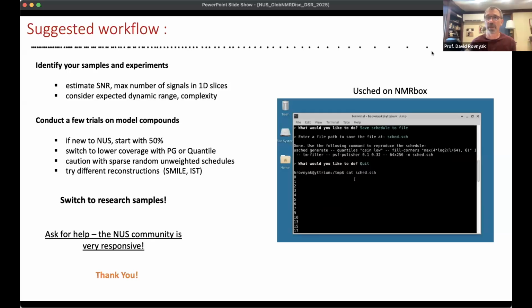Then that sounds like you might be doing weighted NUS, and you might be trying to improve your sensitivity a little bit and trying to favor the current sampling schedule. On the other hand, if you double the amount of NUS points, maybe that tells me that you're worried about quantification, and maybe you're going to be developing a protocol to be gentler on your NUS and do more quantifications. So they take you in different directions, depending on what you want to get out of NUS.